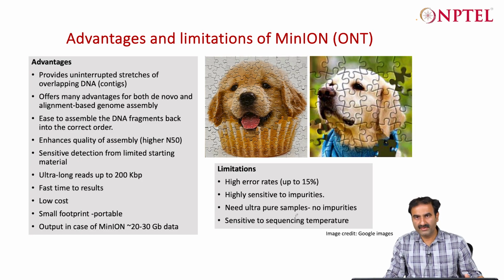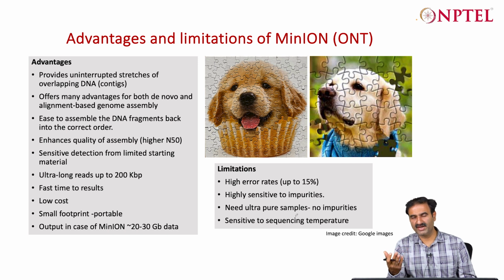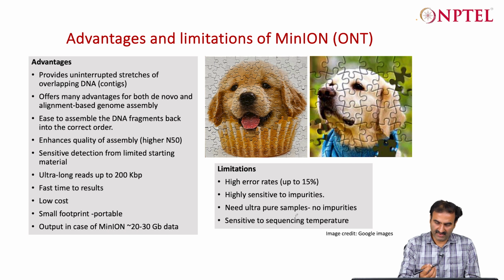Okay, and we also did it earlier, but again just to refresh, long reads help in basically building more contiguous assemblies, which can be corrected by the short read data. The combination of long read and short read is very good, along with the link reads. Different insert size libraries should also be used for Illumina to cover the genomes better.